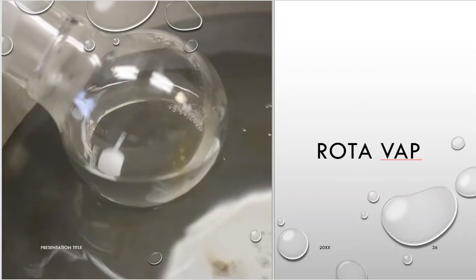All right, if you want a picture of the close-up rotovap, here it is. Nothing really special is happening inside the flask. And actually, at this point, I began to get a little worried. Because I know how this lab is supposed to turn out and how this product is supposed to look, I wasn't quite happy with what I was visually seeing in the boiling flask as it began to distill. I knew that this was not really a finished product or the product that I was after. So I made the decision to go back and do this all over again.